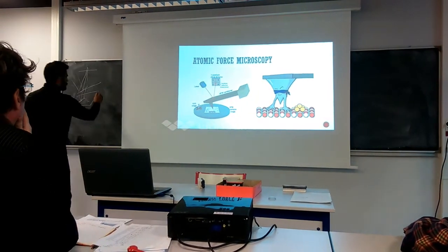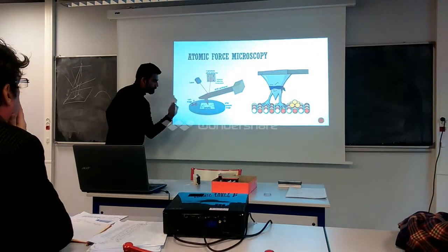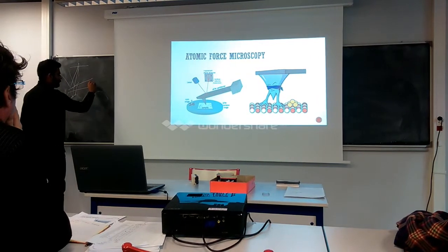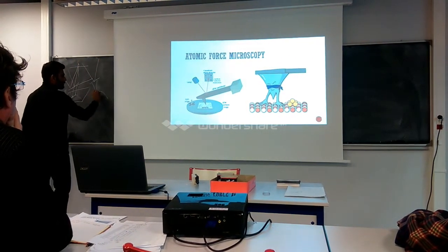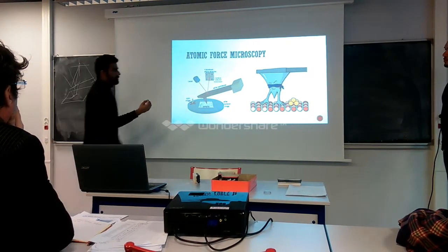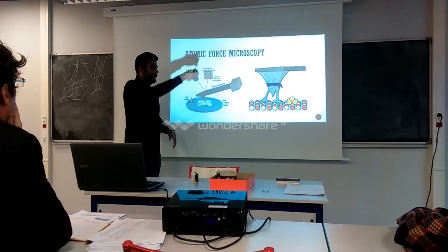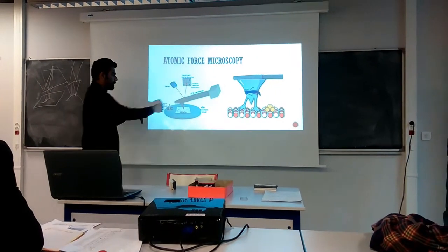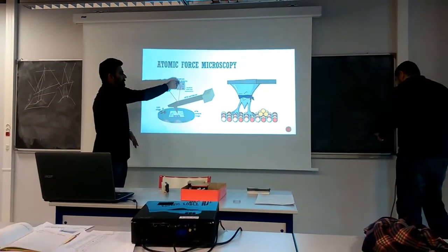Now if the sample were to move sideways, which is how I explained it goes this way, but then if it's supposed to go this way, like into the screen, say you have a frontal view of this. So there's going to be reflection, and when the probe is over here, there's going to be a change in reflection. So there is in fact a deflection on this axis. So there'll be a deflection on x to x dash and y to y dash as the thing moves. So when you place a sample over here, if you're going to scan it this way, you have a set of deflections on these two axes.